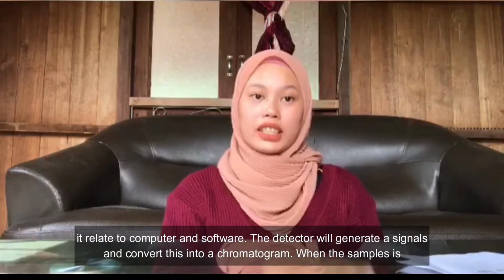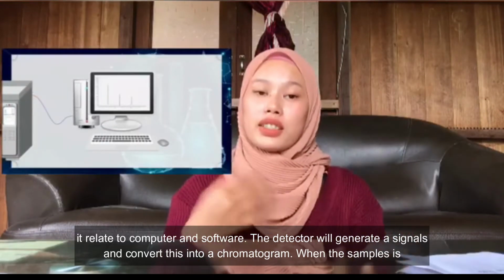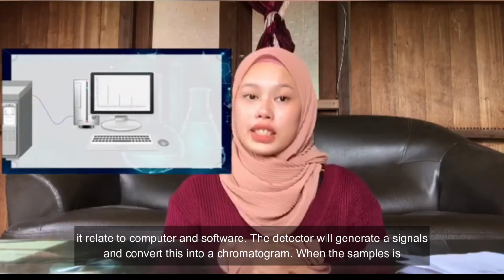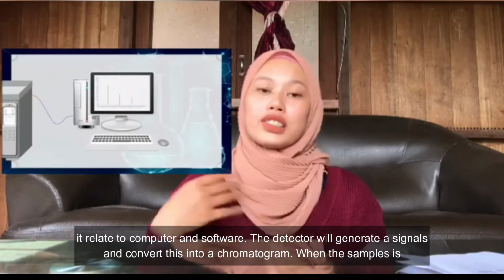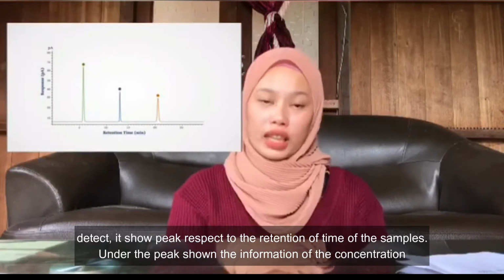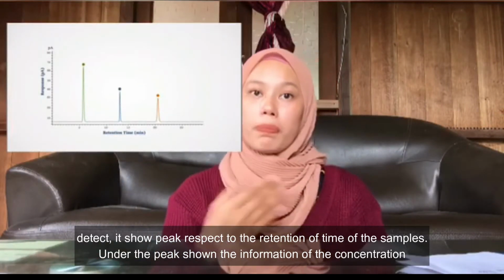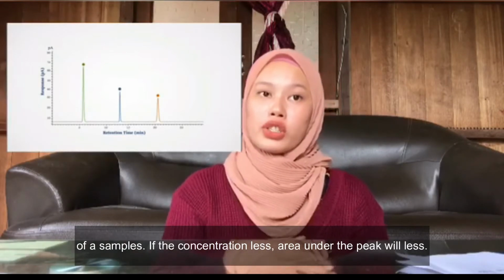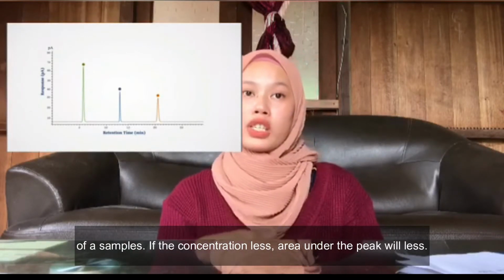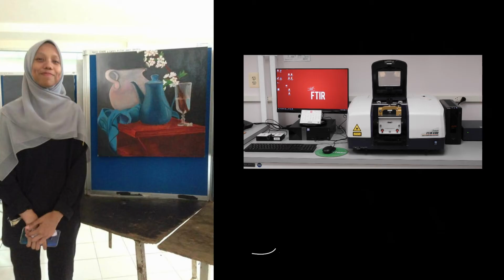In the last part, it relates to the computer and software. The detector will generate a signal and convert it into a chromatogram. When the sample is detected, it shows a peak with respect to the retention time of the sample. The area under the peak shows the information on the concentration of the sample. If the concentration is less, the area under the peak is less.